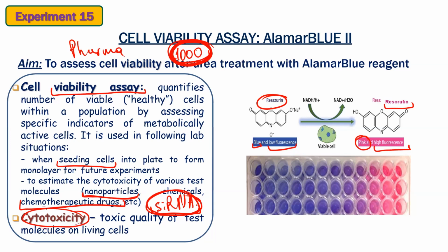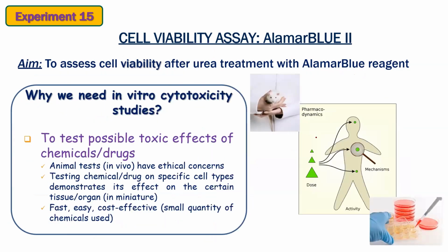So again, cytotoxicity is the measure of the living cells being stressed and undergoing apoptosis or usual necrosis. Okay, so what you do, again, you use your Alamar blue because it's being reduced when we have a viable cell.